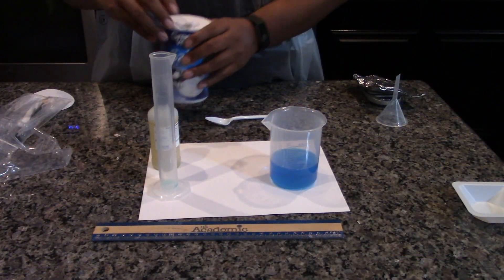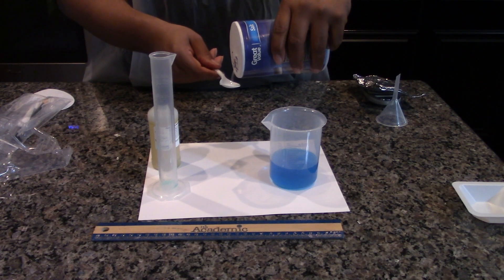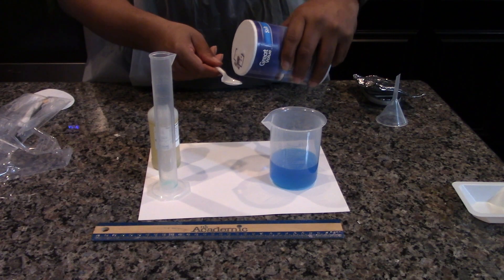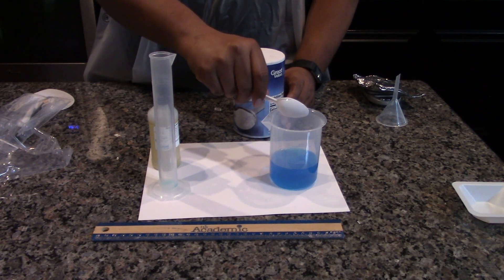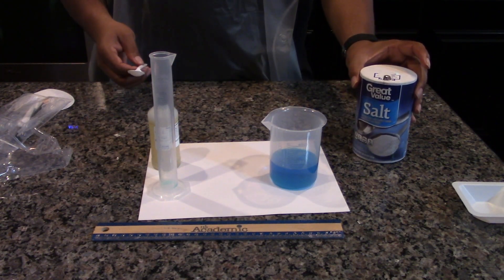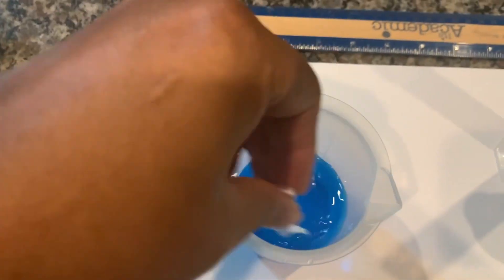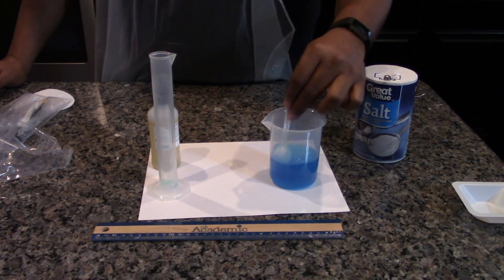Add some of the sodium chloride to the copper sulfate solution using a teaspoon. The sodium chloride is a catalyst, so the exact amount is not important. Stir the solution with the plastic spoon to dissolve the sodium chloride.